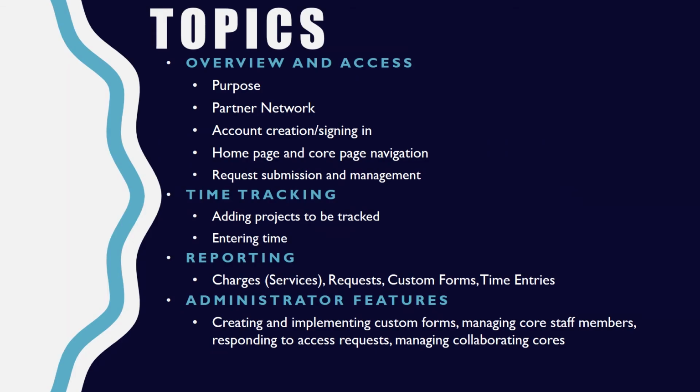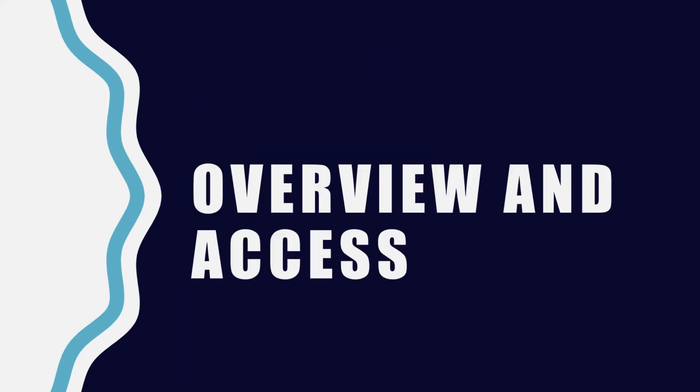Some topics that will be covered in this presentation are overview and access, including how to create an account or sign in, navigating through iLab, and submitting and managing requests. This presentation will also cover the time entry module, the reporting module, and administrator features. We'll start with overview and access.